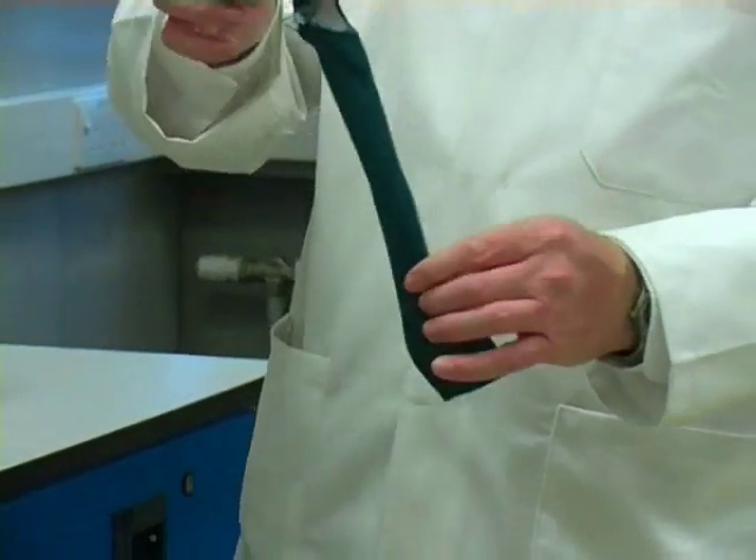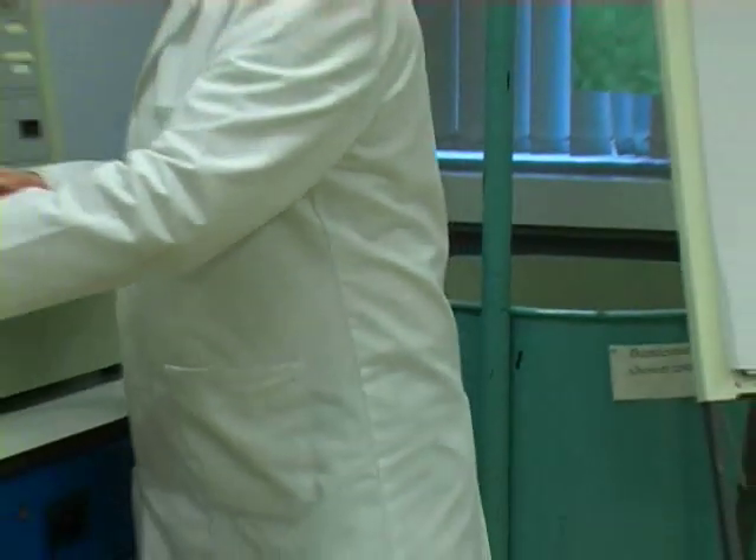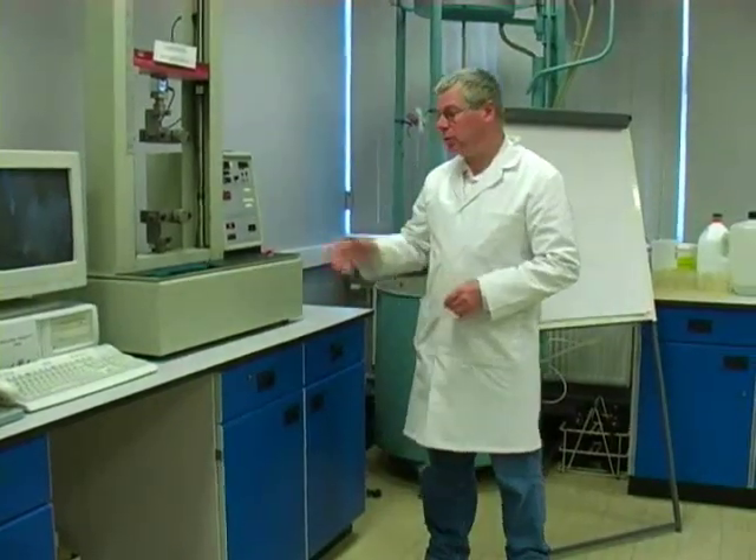And that's our test done. On a British Standard test we'd repeat that five times in the warp direction and five times in the weft direction to get the warp and weft strength of the fabric.